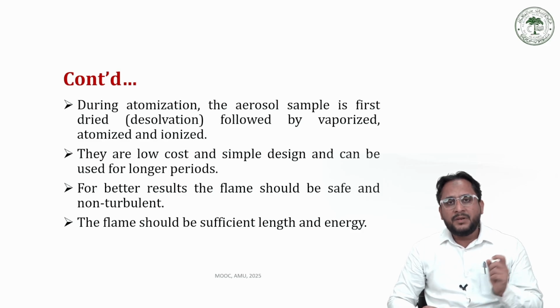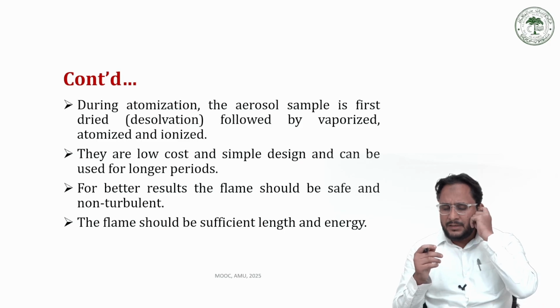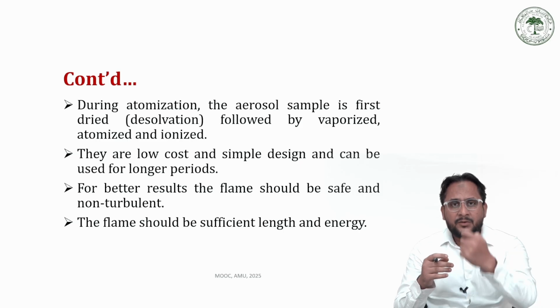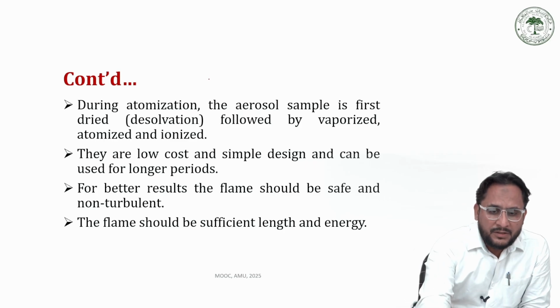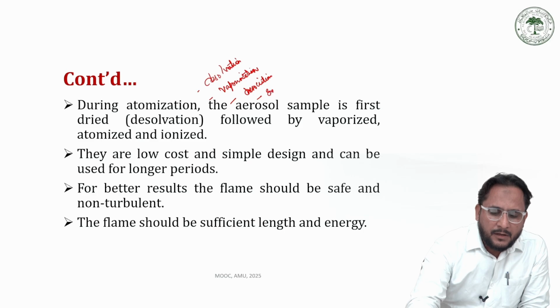So when the sample enters through this capillary tube, while we have two inlets for the fuel as well as oxygen gas, they create a flame with very high temperature. When the sample elutes from that capillary tube, it first of all undergoes desolvation, then vaporization, dissociation, and finally excitation.